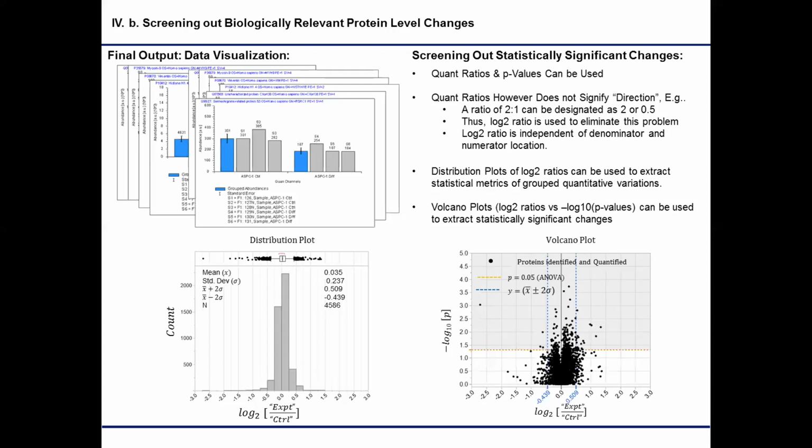The protein levels, though, and that's the type of data that Dr. Wijeron is showing here, do often follow a fairly normal distribution. But you could have something that would disrupt that, like perhaps a disruption of the proteasome or something that causes a very large change in protein abundance.